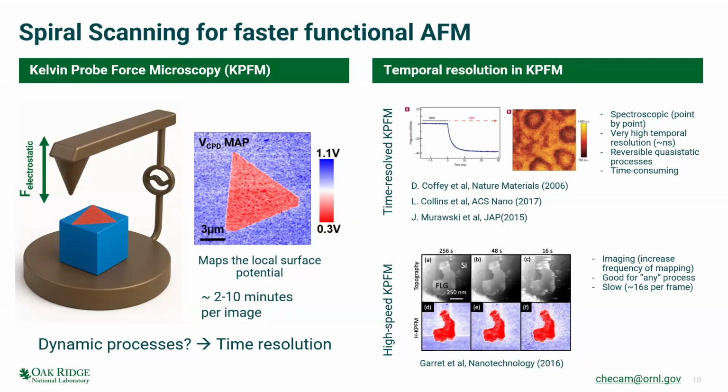Well, I could make up a story, but I'm just going to be honest. We had that sample in the lab that had nice domains in plane. And I thought that the spiral scanning would be good to tune those in-plane domains. I have tried other samples that have in-plane polarization too, with more or less success.